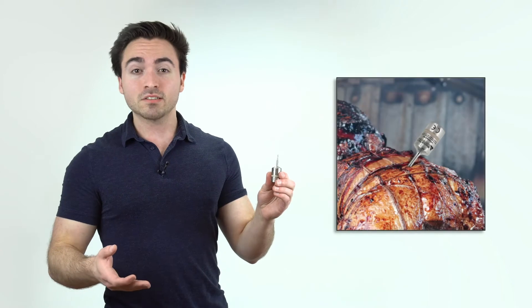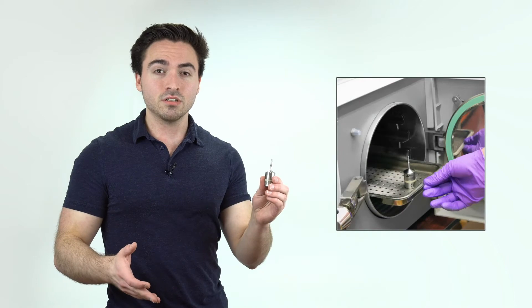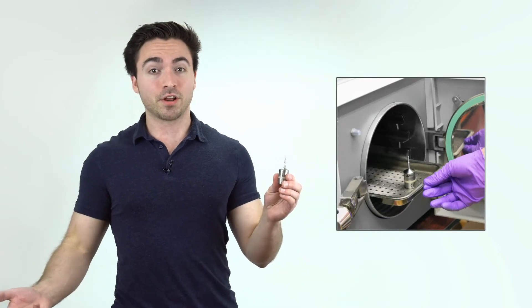The HITEMP 140 also comes in many different probe styles and lengths, giving it the ability to adapt to almost any application. Some common applications are food and meat processing, laboratory studies, pasteurization, autoclave validation, and most any other temperature monitoring application.